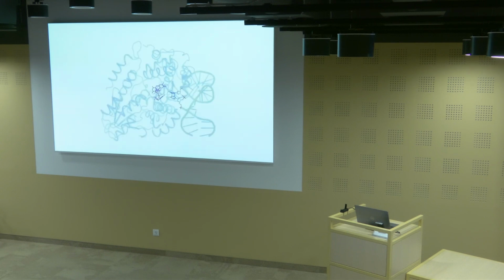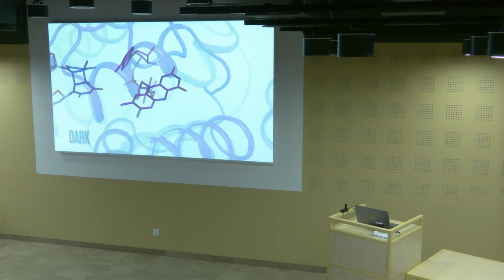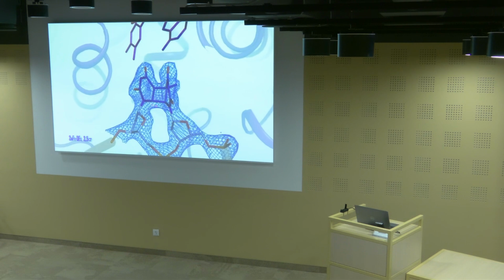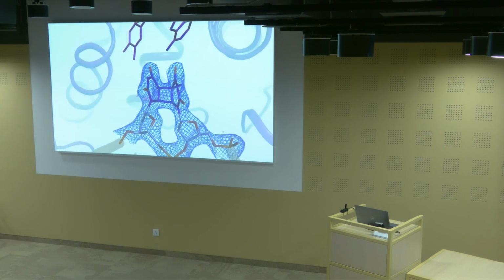Second question involved the lysis of these bonds. So I'll play another movie that now goes a little bit further in time. So we have this dimer splitting that we're interested in. And we'll reorient ourselves now to basically look at this thymine dimer more directly. So you can see the 4-membered ring quite clearly here in the CPD dimer.